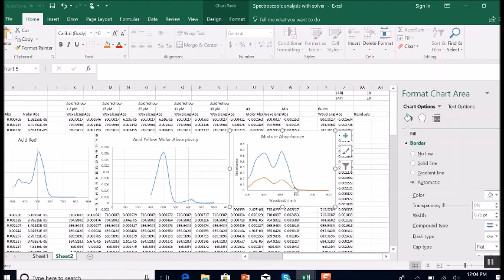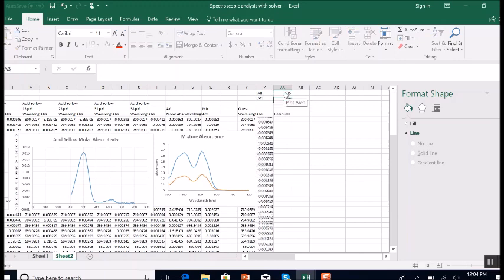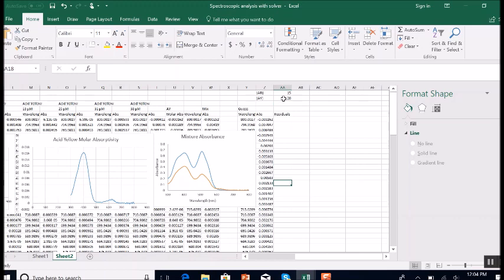Now our guess was not that good. We guessed pretty far off. This spectrum, our guess, does not match the real spectrum. So what we could do is just change the numbers. Looks like we need to go up a little bit for both. And we can just keep playing with those numbers till we get closer.